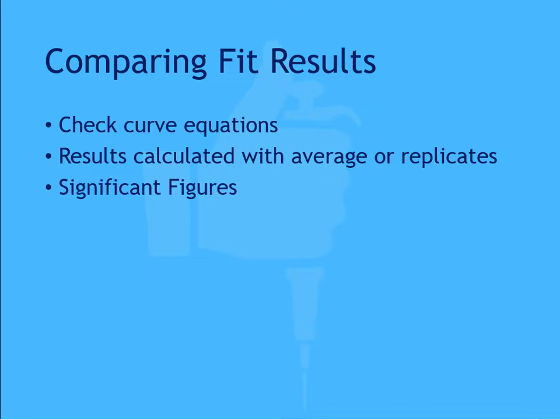Be sure the same number of significant figures are used in both applications. Check to see if a weighting method is applied, and if so, is it the same weighting method? Also check to see if any transforms are used, such as log or anti-log.